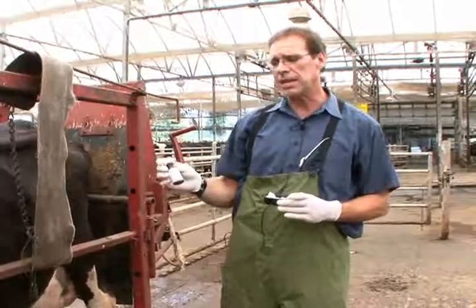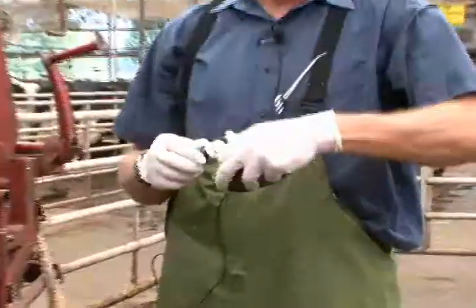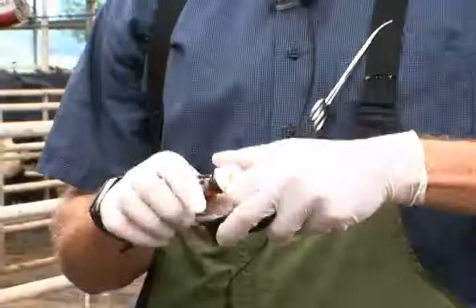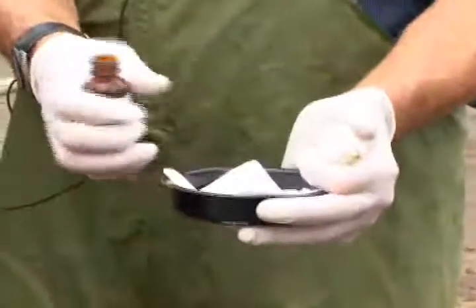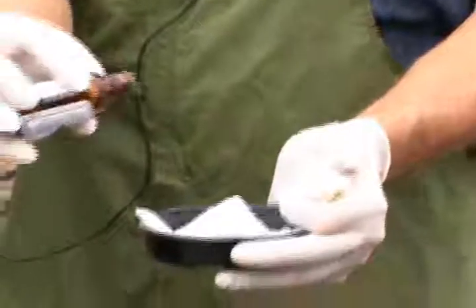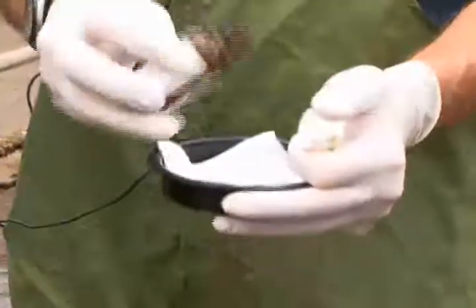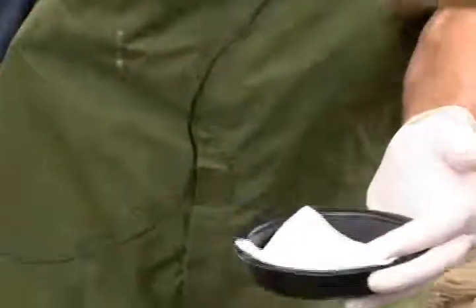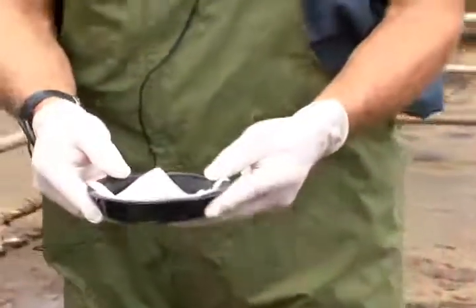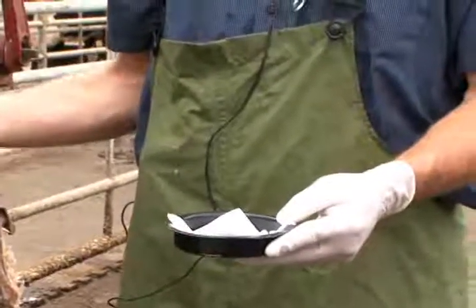The test that we use in that case is typically called the KetoCheck test and it is a powder. What I like to do is use a 4x4 gauze and then I just put some of the white powder onto the 4x4 gauze. These crystals in this powder will react with the milk if there are many ketone bodies in the milk.